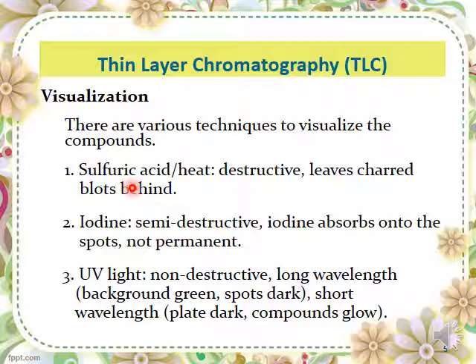separated component. The second technique to visualize is iodine. This is semi-destructive because iodine vapor will absorb on the spot temporarily. Once the iodine vapor vaporizes, the spot becomes invisible again, so it's not permanent. Once you see the spot, you can mark it using a pencil.